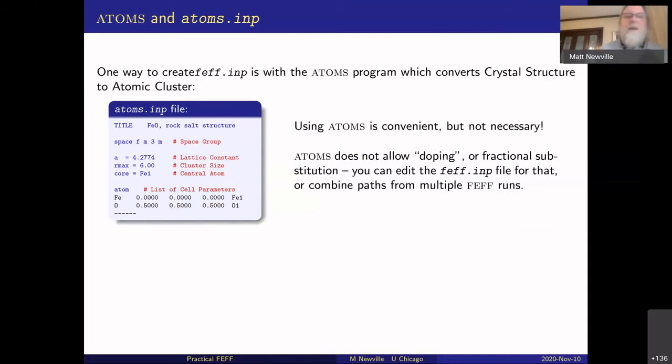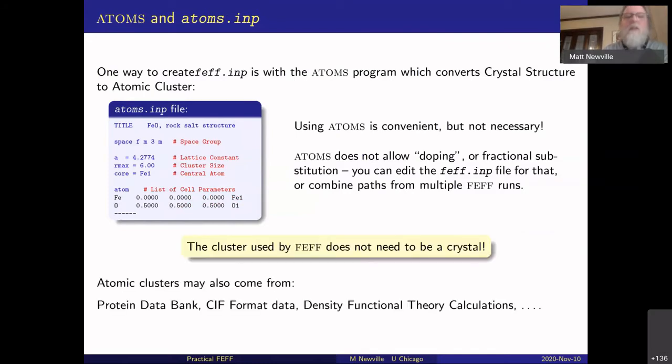One way to create FEFF input is with the Atoms program, which came with Athena, and actually we have a website now that can do this too. If you Google Web Atoms, you should find it. You can look up a crystal structure and then run FEFF on it. It does not need to be a crystal structure.